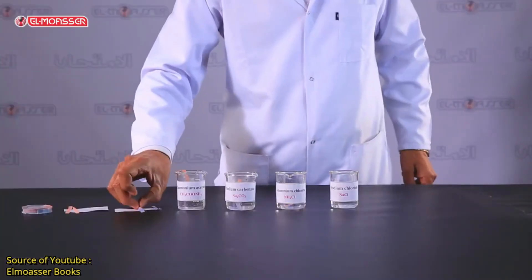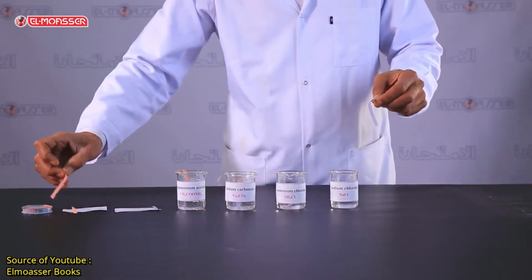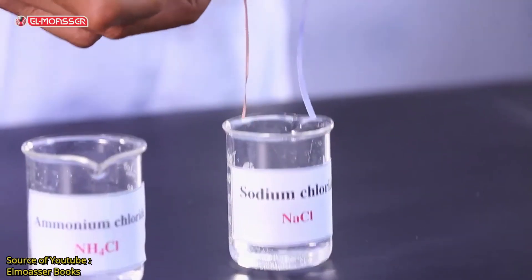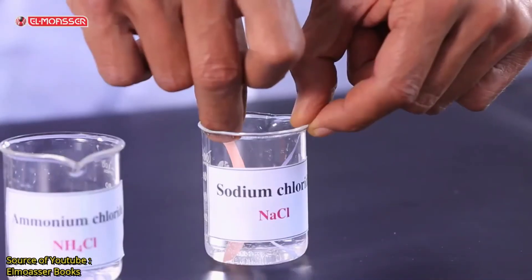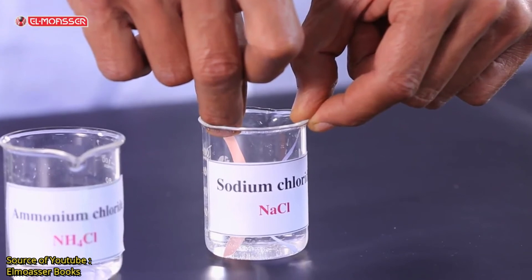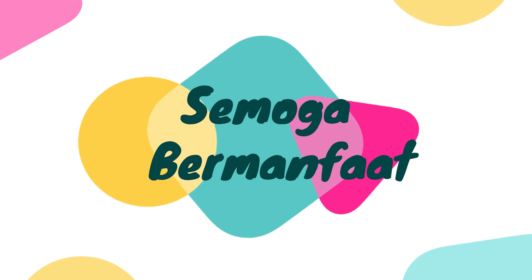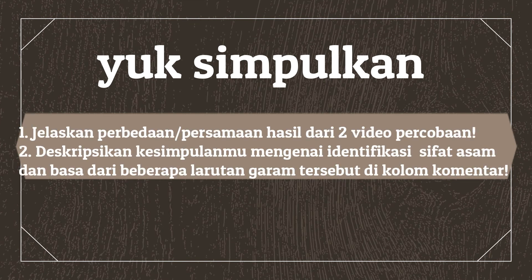In the sodium chloride solution, we use a blue litmus paper and a red one. What do you observe? Both the blue and red litmus papers don't change, indicating that sodium chloride solution is neutral.